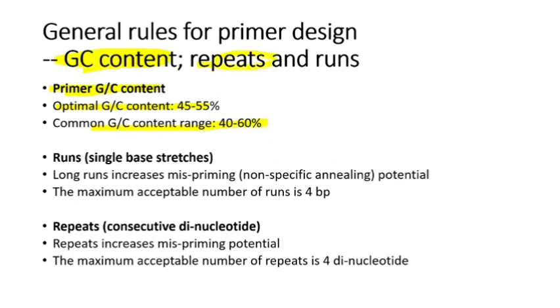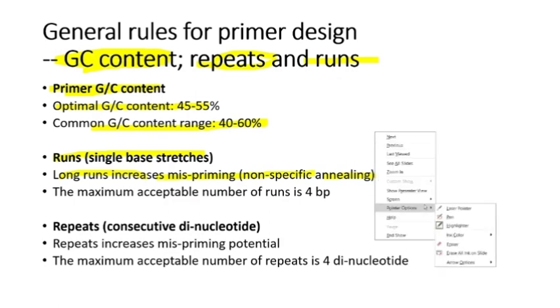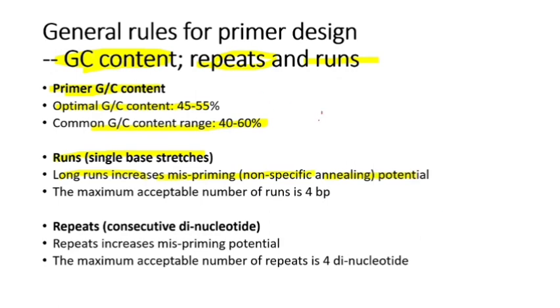Next, repeats and runs. We will see runs first. Single base stretches, long runs, increase mispriming or non-specific annealing potential.